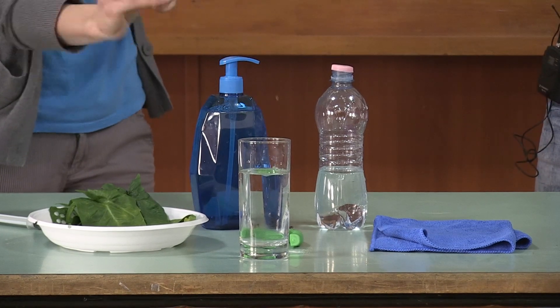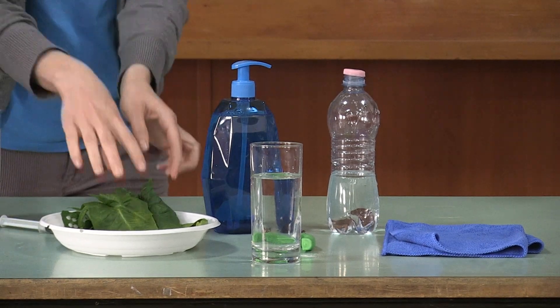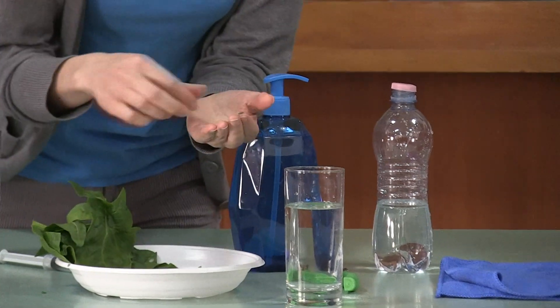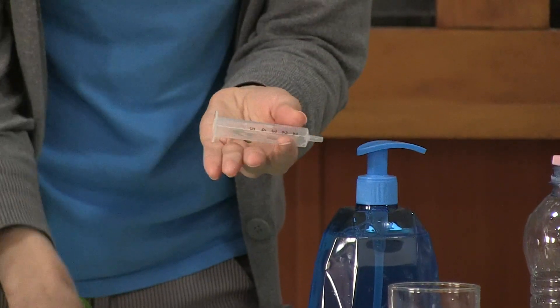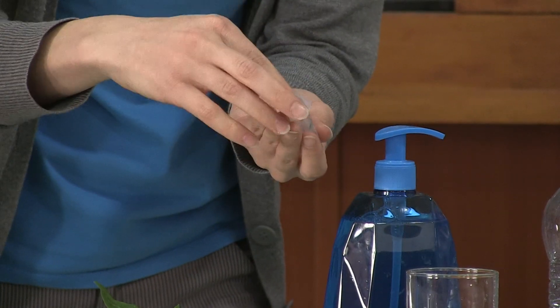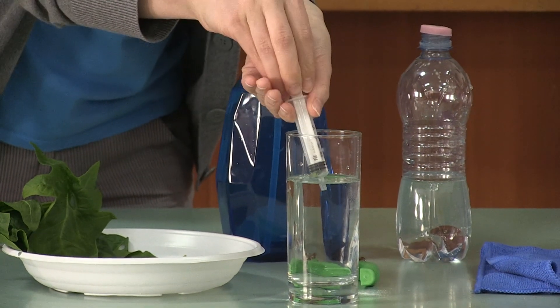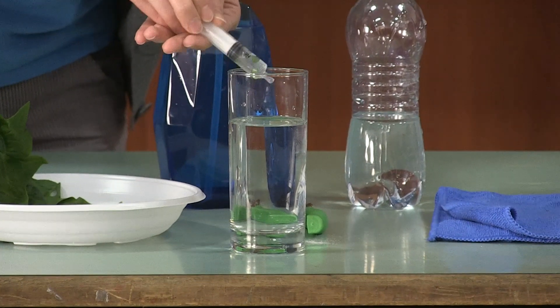Mix it a little bit and now we will take small pieces of the leaves that we prepared — just a few of them, four or five, something like that. Place them into the syringe. Now we will fill the syringe with water from our glass. We don't need much — just a little.